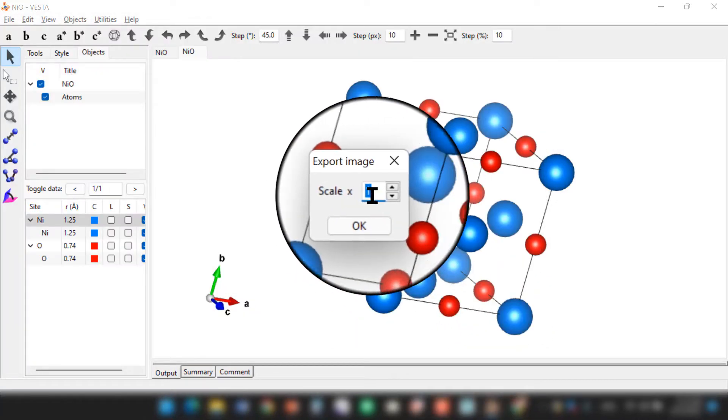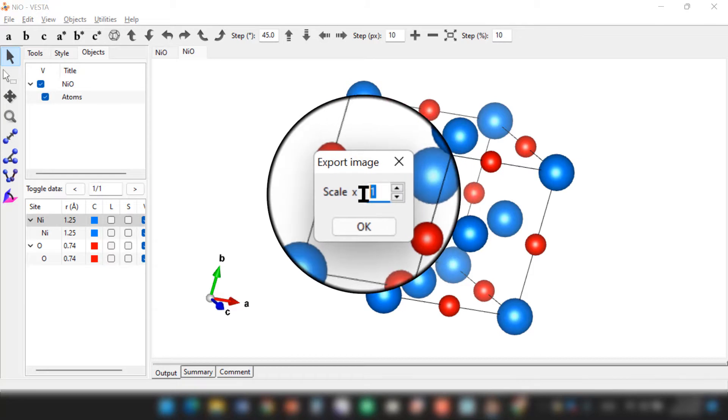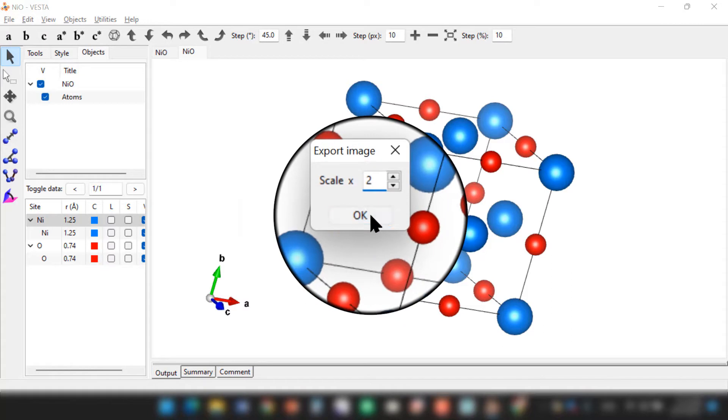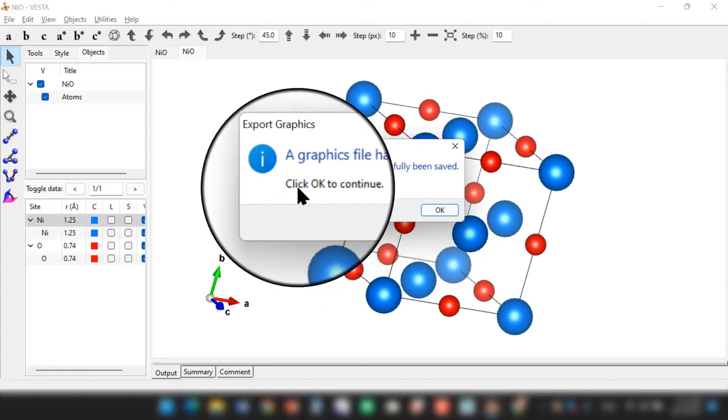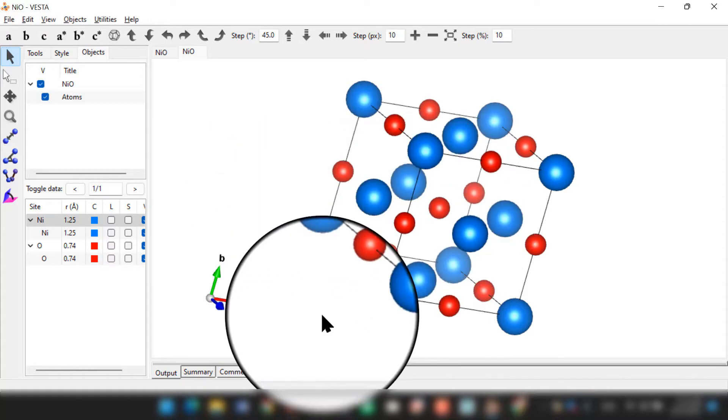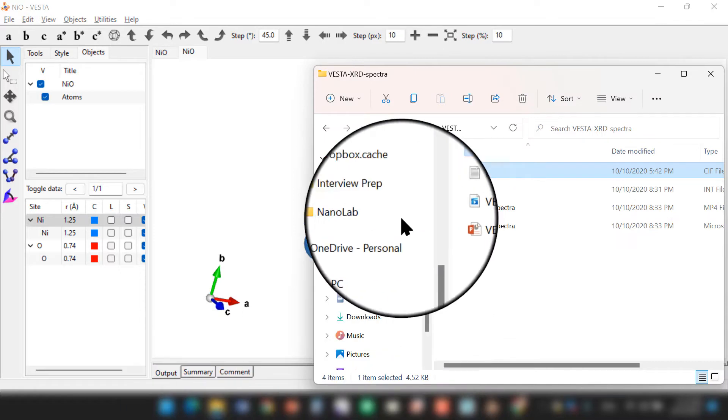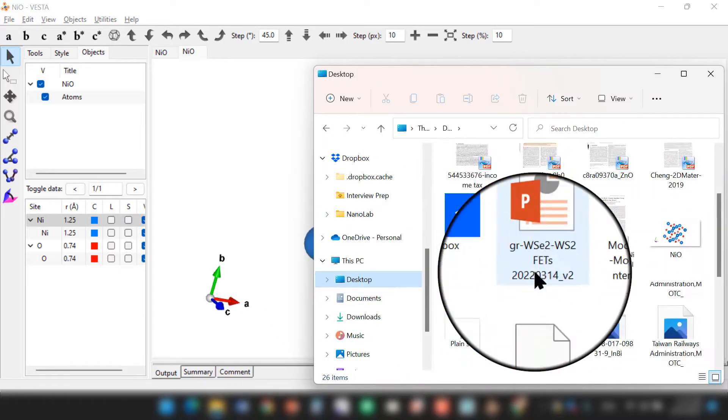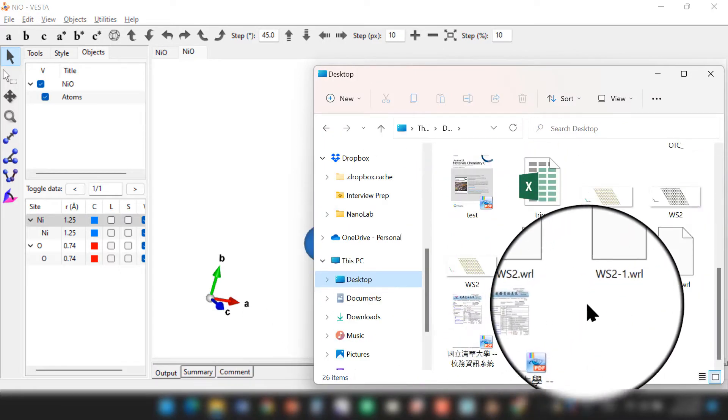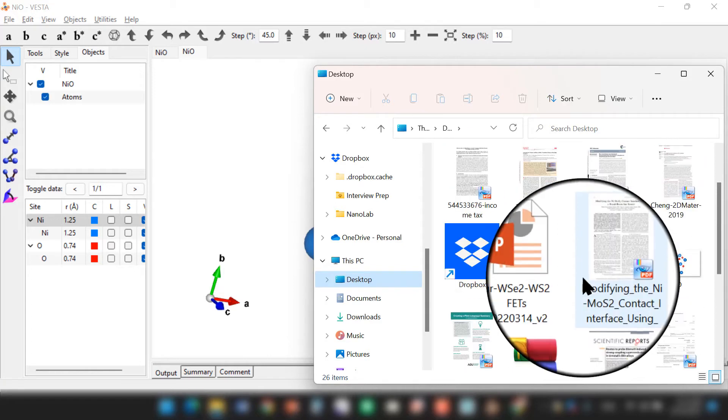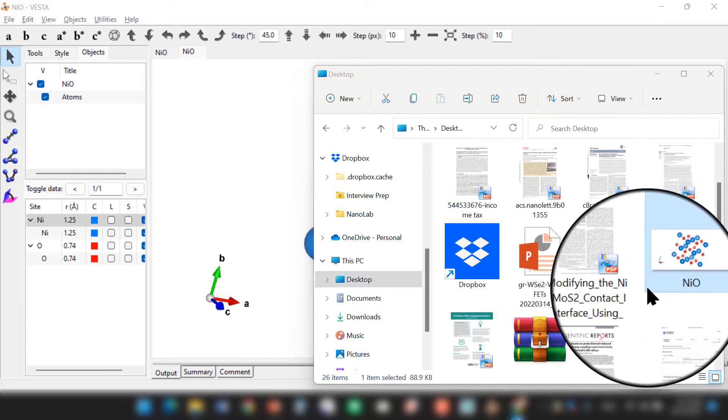Here you can choose the scale. If you use high scale, the size will be bigger but the resolution will be better. I will choose maybe scale of 2 and save it. OK, so click Continue. OK, so our structure has been saved and this is your nickel oxide.